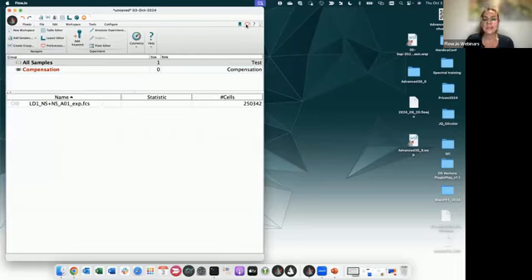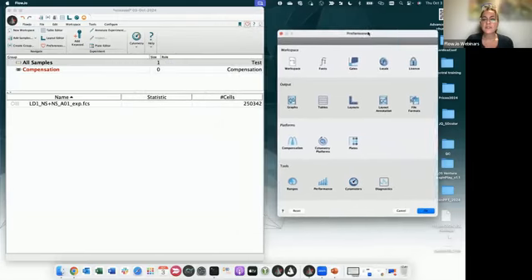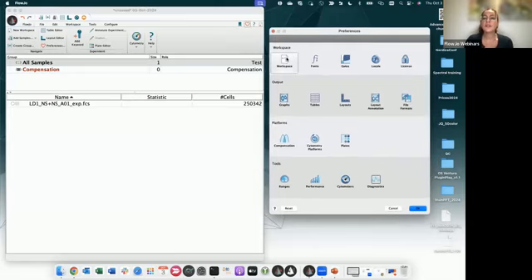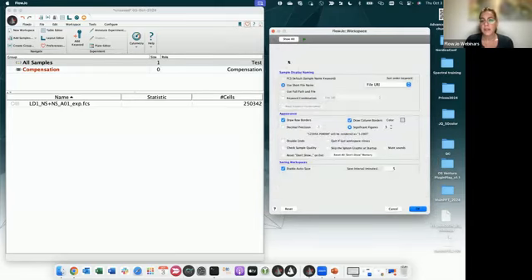In your preferences, if you click on the heart icon on the top right corner of FlowJo, you can go into Workspace and choose to use the short file name. The short file name is actually the way you named the file at the instrument.